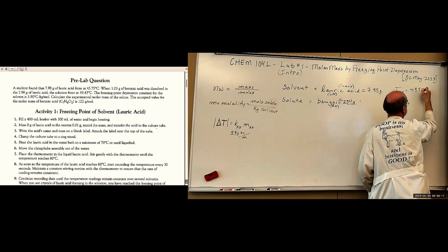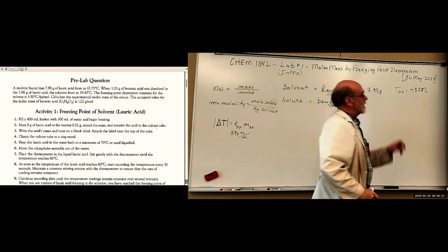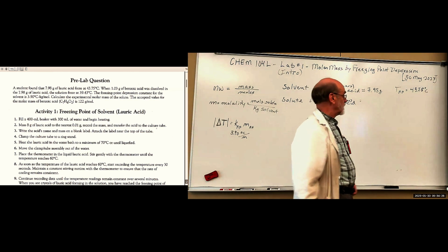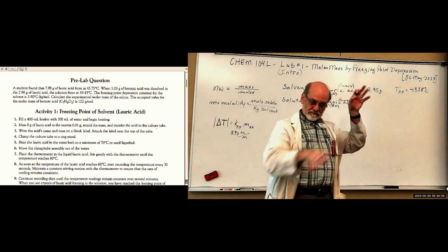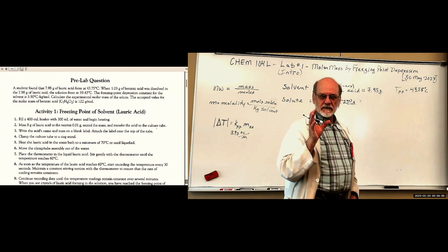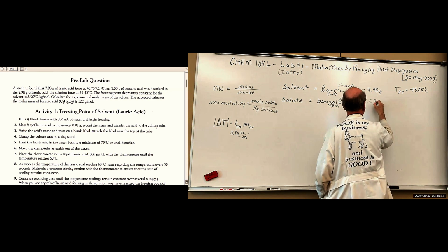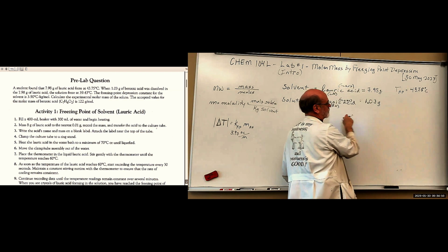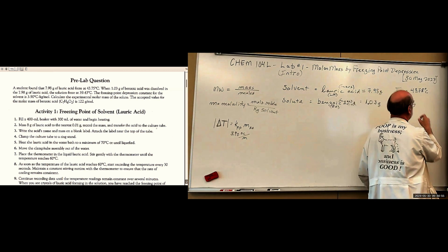So that tells me that they were using an electronic thermometer, one that would read 2 decimal places. So that's the freezing point that was determined from plotting the values. Then they put 1.03 grams of benzoic acid in it. And the freezing point of the mixture now is 39.43.